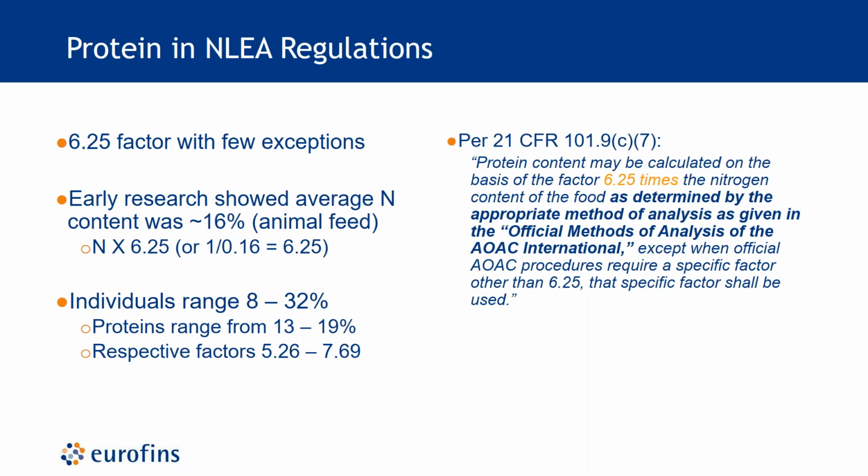So that doesn't seem like a huge difference from 6.25, but you have to think about it in the context of when you're multiplying that number by nitrogen. It can extrapolate, usually overestimate, the protein that you're seeing, and we'll touch on that further, but that can actually extrapolate to a much larger, more significant number. So that's really the first problem with 6.25: individual amino acids are composed of different amounts of nitrogen, and when bonded, they're obviously going to have different levels of nitrogen as well.